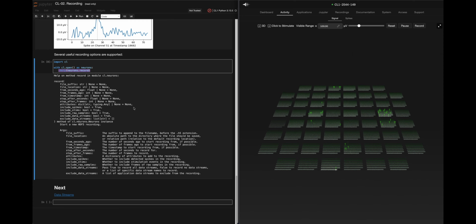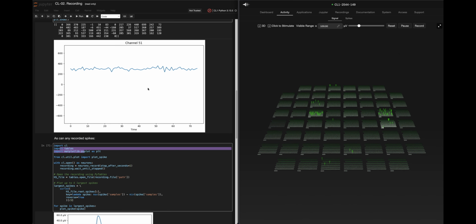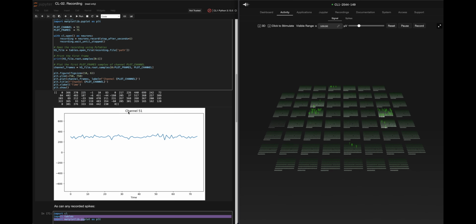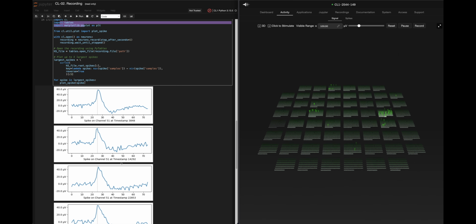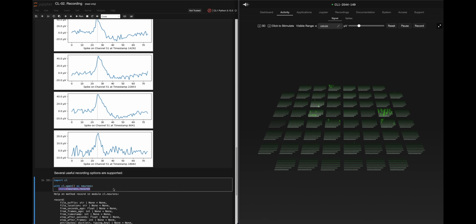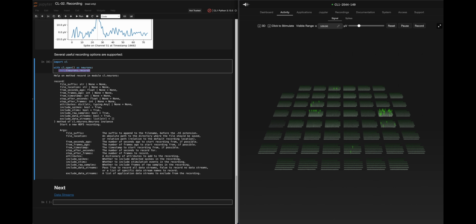So I think we'll close it out here, but I do intend to get a little bit more technical, especially in these two areas, in future videos, because I think we got a very good understanding of it in this video. But as you could see down here, with all the different recording options that you have, there's so much that you can do, so much that you can accomplish.